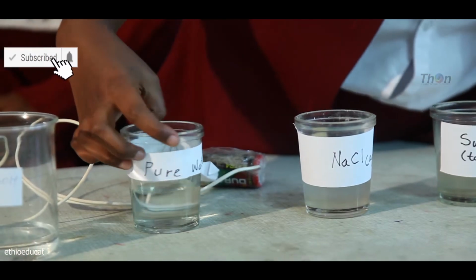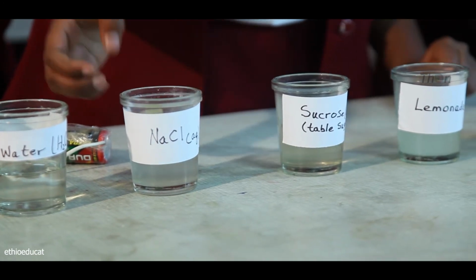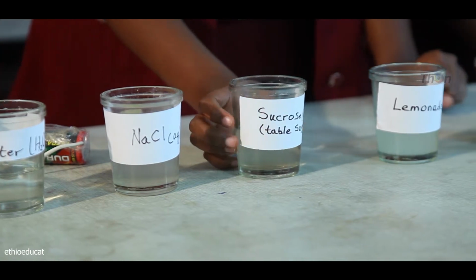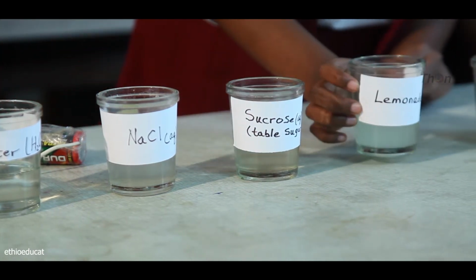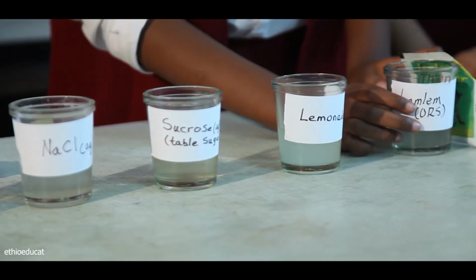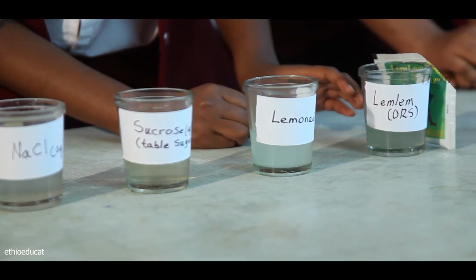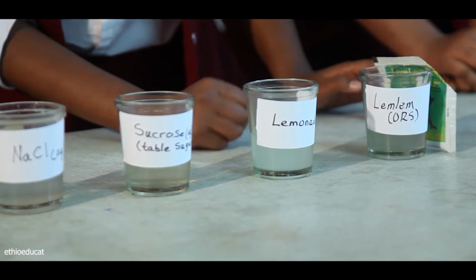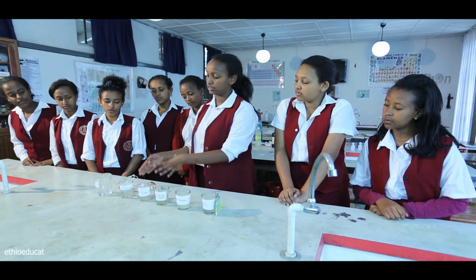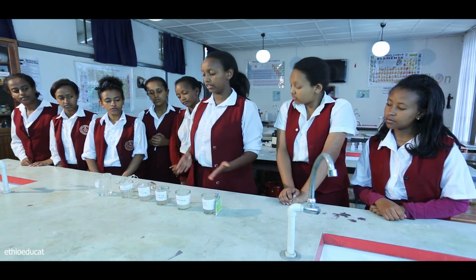We have here pure water. Then we have sodium chloride, or normal table salt, which is in solution form. We have sucrose, which is table sugar in solution form. Then we have lemonade, squeezed from a fresh lemon. And here we have a common drug which we use for young children when they get sick, commonly known as lemlem or ORS, oral rehydration salts. So we'll insert the apparatus into each compound and we'll see whether they are covalently bonded or ionically bonded.